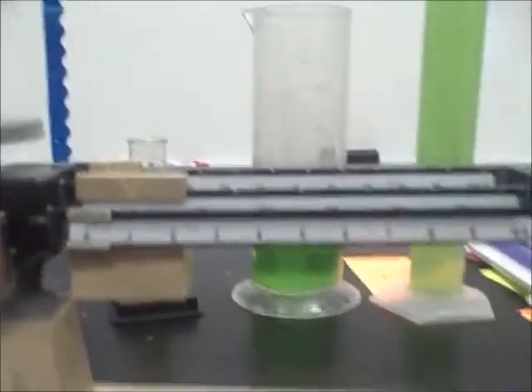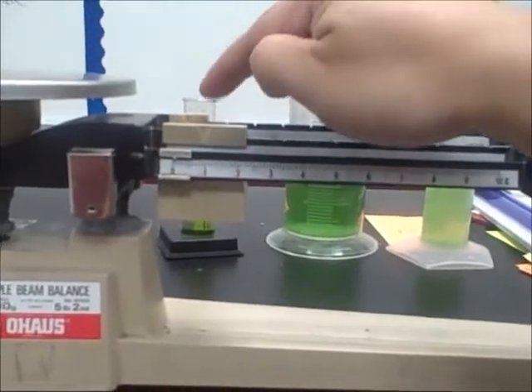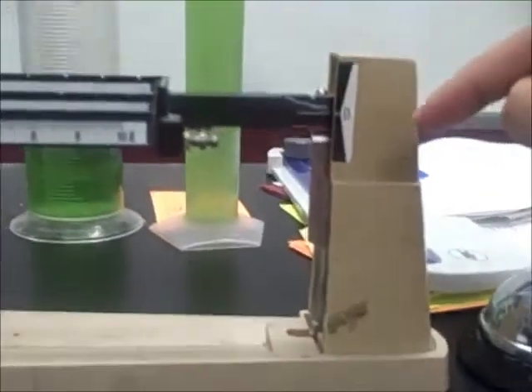Before you use a triple beam balance, it's very important to make sure that all your riders are at zero, like they are here, and that your balance is zeroed. To make sure it's zeroed, the two lines should line up — the line on the beams should line up with the zero mark. To zero the balance, there's a knob all the way over on this side that you can turn to zero the balance.